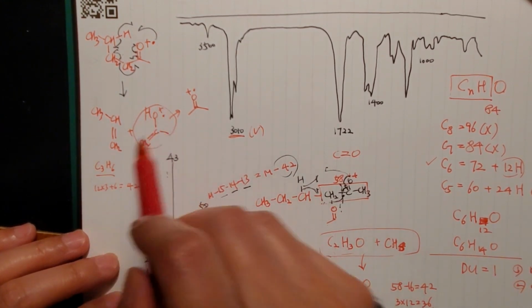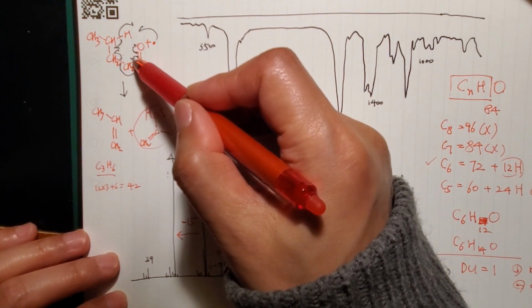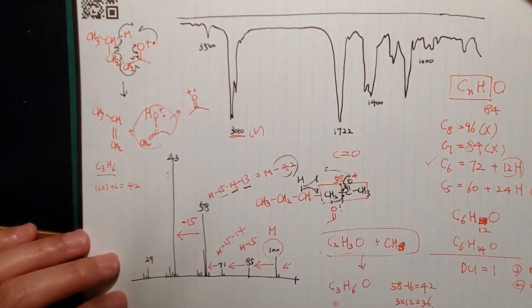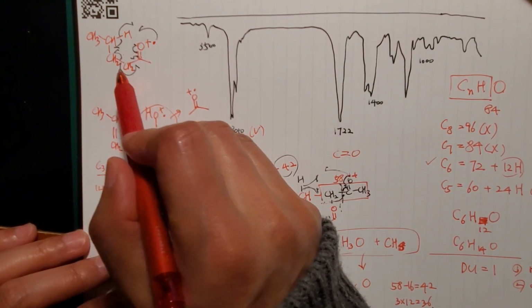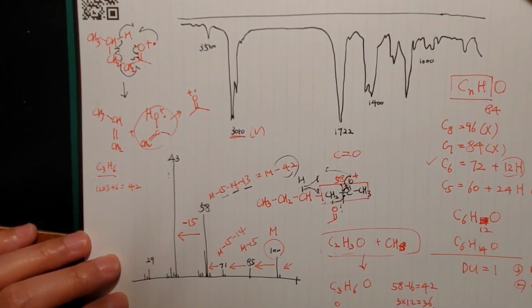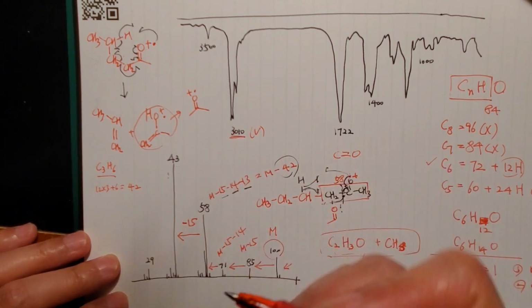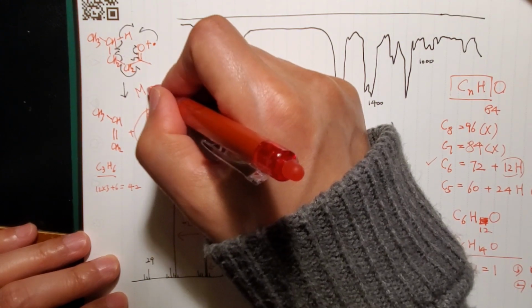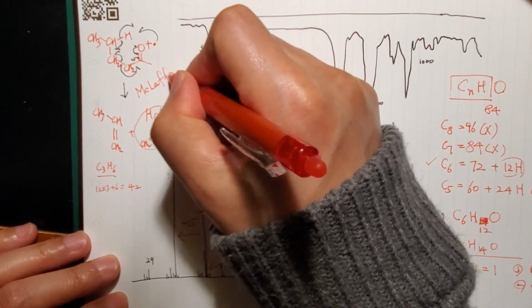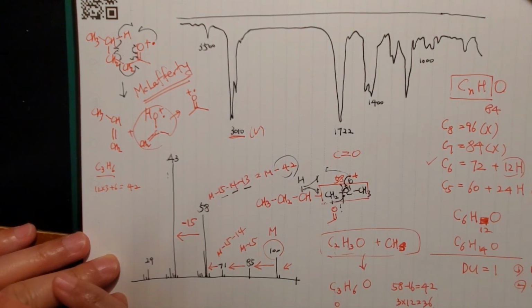And this unique mechanism, you don't do alpha cleavage as a homolytic or heterolytic, or you don't remove this hydrogen and do elimination. But this is a fourth type of mechanism I didn't mention, but a few minutes ago I talked about this. This is devised by a professor at Cornell University, McLafferty. Rearrangement. Very useful for carbonyl.